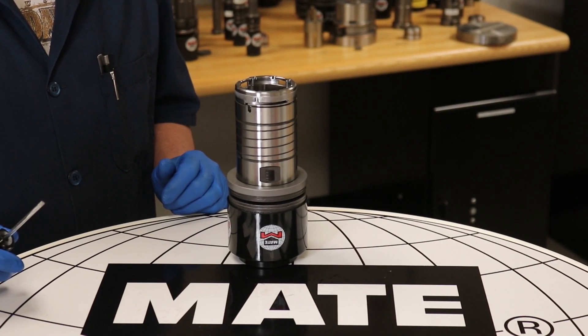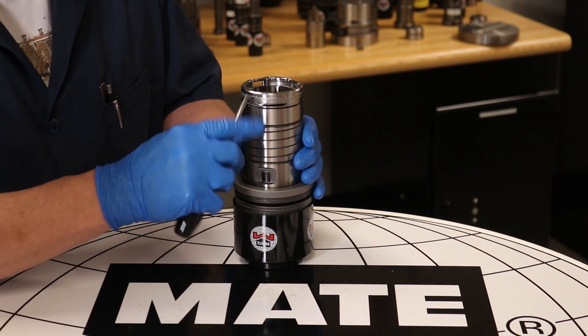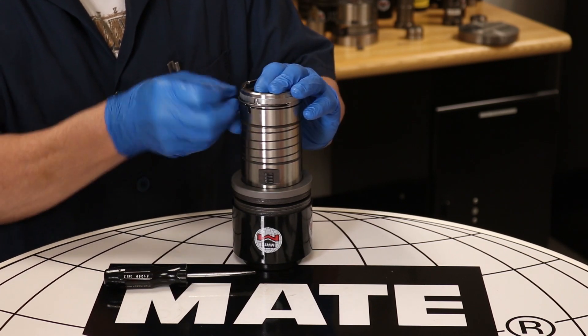First, we'll use a small flathead screwdriver to remove the retainer ring. Using your free hand, apply pressure to the lock ring at the top of the assembly. Pull the retainer ring from the assembly using your fingers.